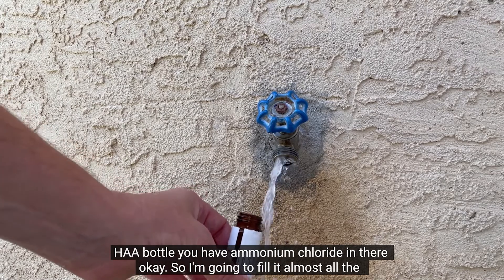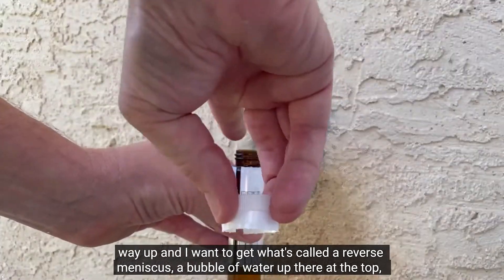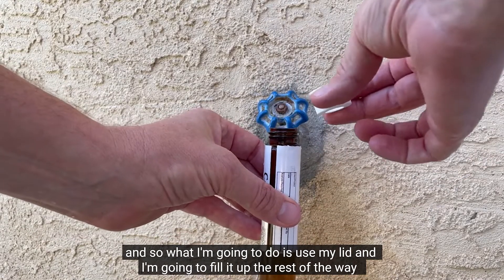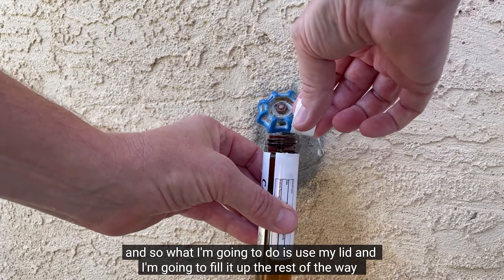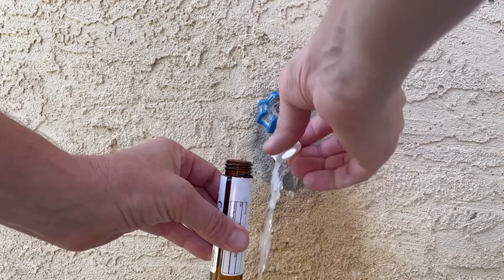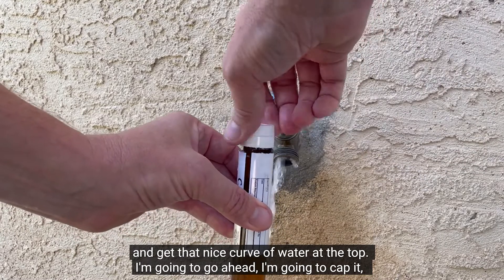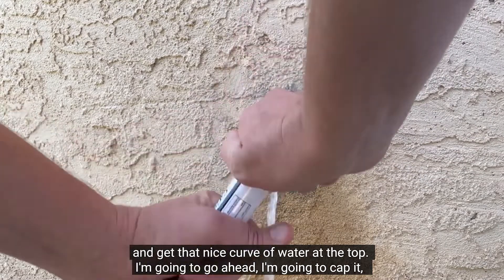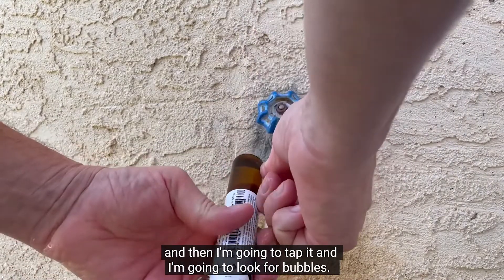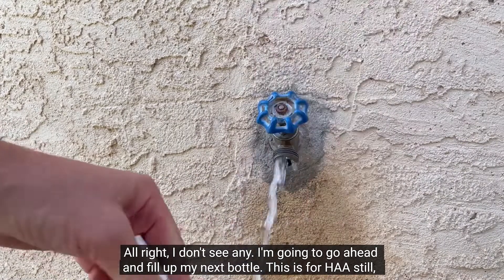I'm going to fill it almost all the way up, and I want to get what's called a reverse meniscus — a bubble of water up there at the top. I'm going to use my lid and fill it up the rest of the way to get that nice curve of water at the top. Then I'm going to cap it and look for bubbles. I don't see any.